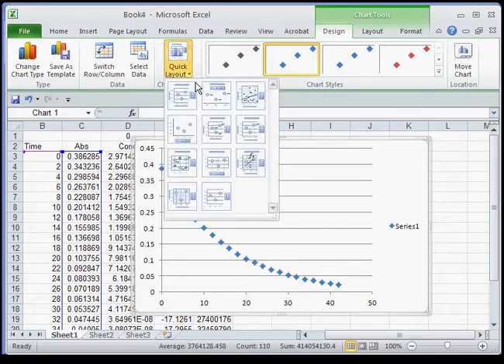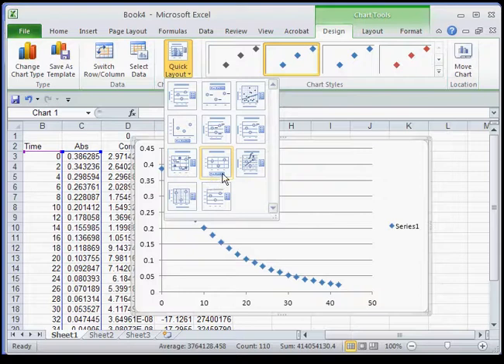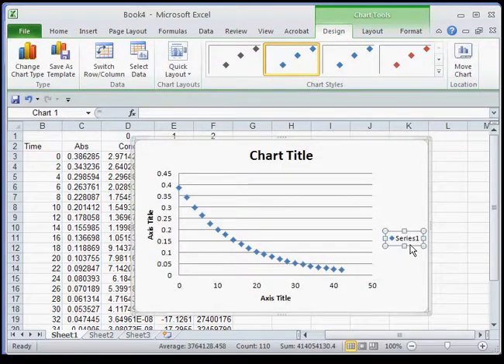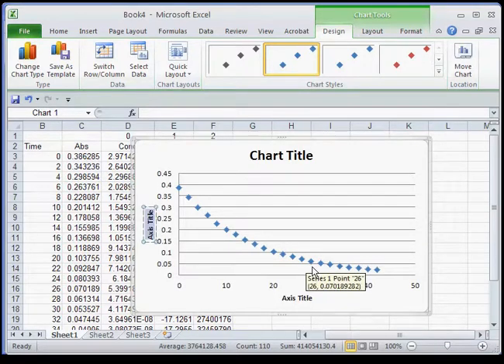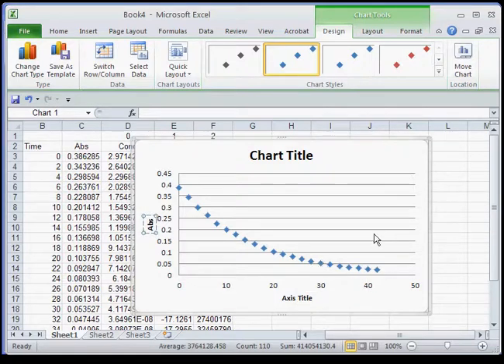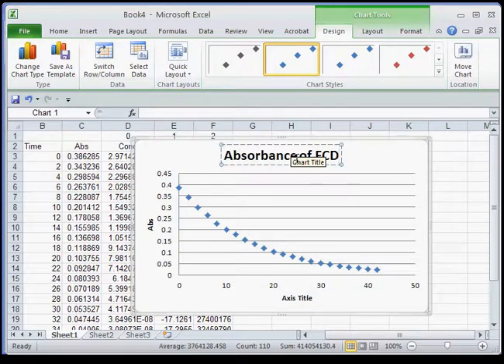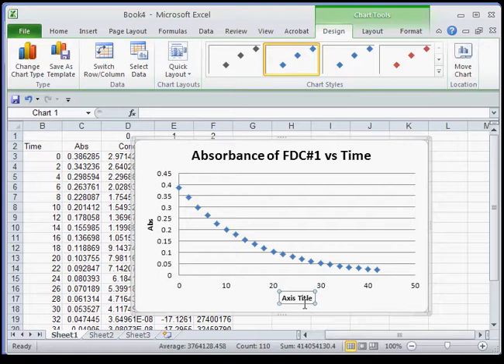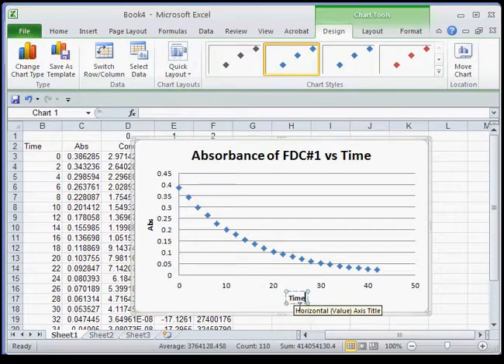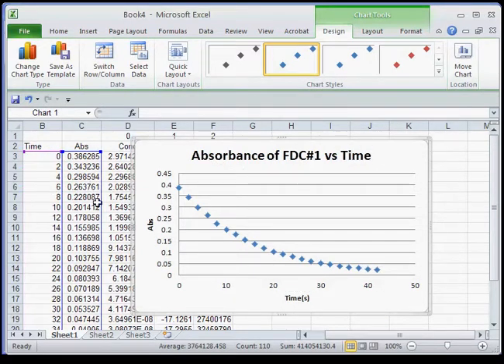Next, format the chart using a quick layout — some of these work well for this type of data. I'll select one, remove the legend, and label the y-axis as 'Absorbance.' The chart title will be 'Absorbance of FDC #1 versus Time.' For the bottom axis, I'll label it 'Time in Seconds.' That's the first graph done.